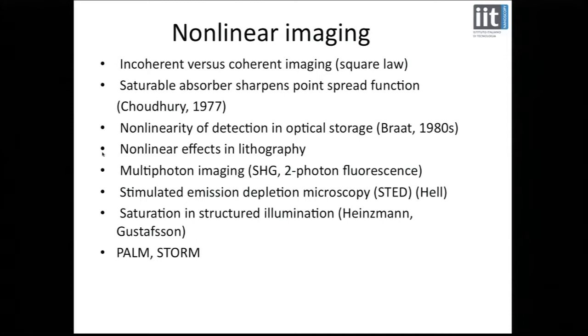Just to sum up, I've got a couple of things to sum up. One is there's a lot of controversy. I think Rainer Heintzmann will maybe say something about this, because I think he agrees with me a bit on this, that a lot of these super resolution methods are based on a nonlinearity. So things like PALM and STORM and STED, there is always some sort of nonlinearity. The fact that you can get an improvement in resolution from nonlinearity has been known for a very long time. In, for example, lithography, which is a very good example, we've known that for a very long time.